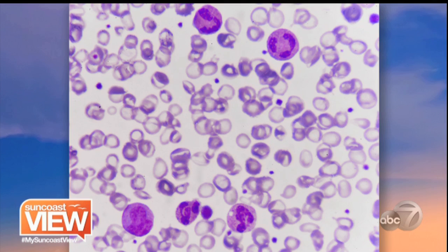So like this slide is showing what? This is an actual patient of mine. If you're looking at this slide right here, this is a patient that presents anemia. This person has a lot of autoimmune issues, but you see how the normal cells look round and full and red. You see how a lot of those little ones right there are clear, and you can just see the ring, and a lot of them look hollow, like they have little holes in them. So that's a sign of somebody that's anemic.